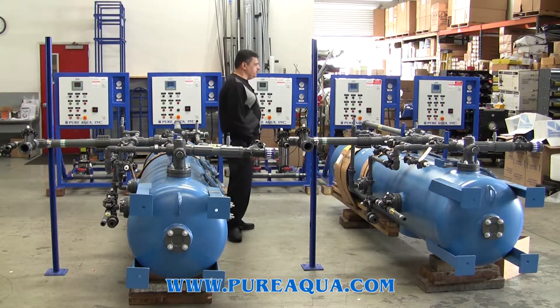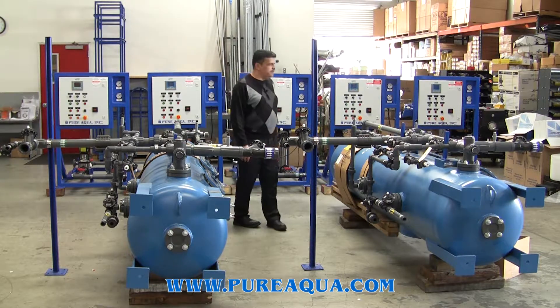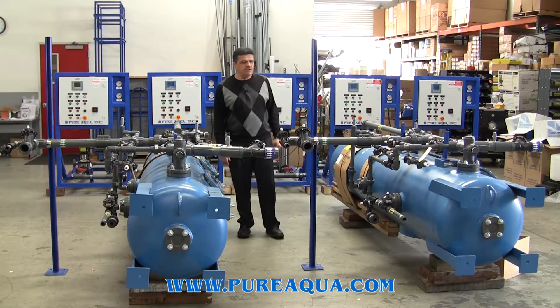This shipment is going to Kuwait today and includes five different durian standby repressurization pumps.